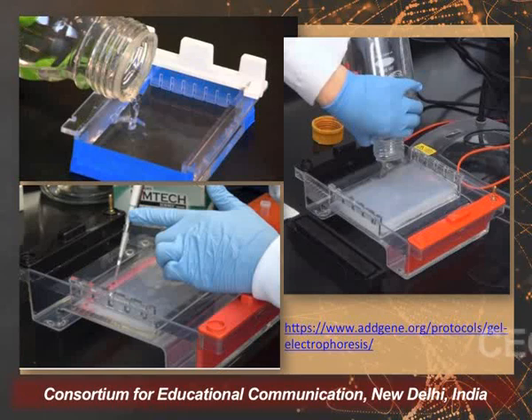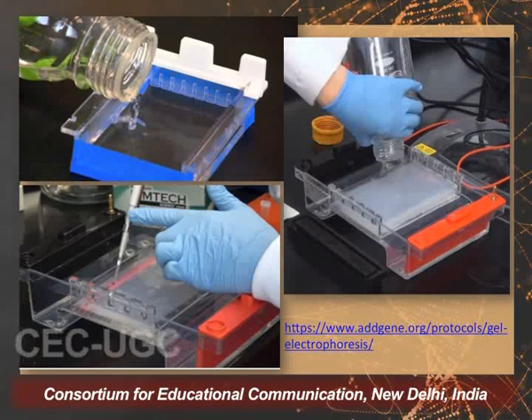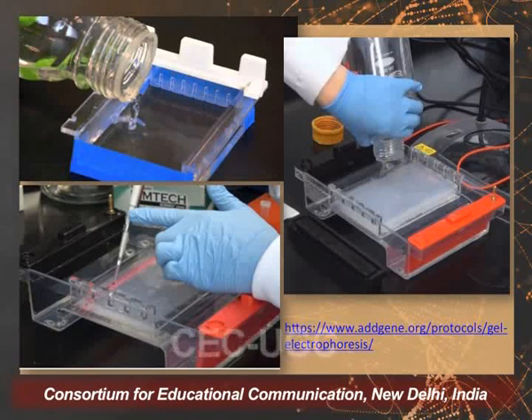So, in the casting tray, we put the comb and we pour the solution of the agarose containing the ethidium bromide. So, this is put like this. It has to be sealed from all 4 sides so that it does not leak. And on the top, you can see that a well comb is put in and the agarose gel is carefully poured into the casting tray.